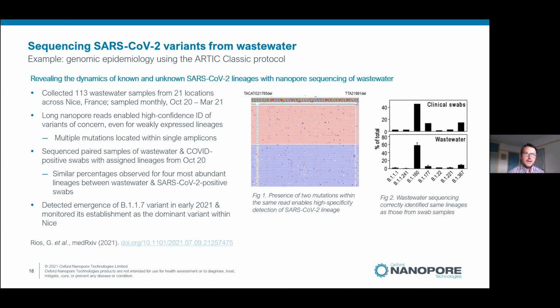And so they were able to extract the RNA from the wastewater, and were then sequencing them and being ready to start to deploy interventions when they're needed and in the future.